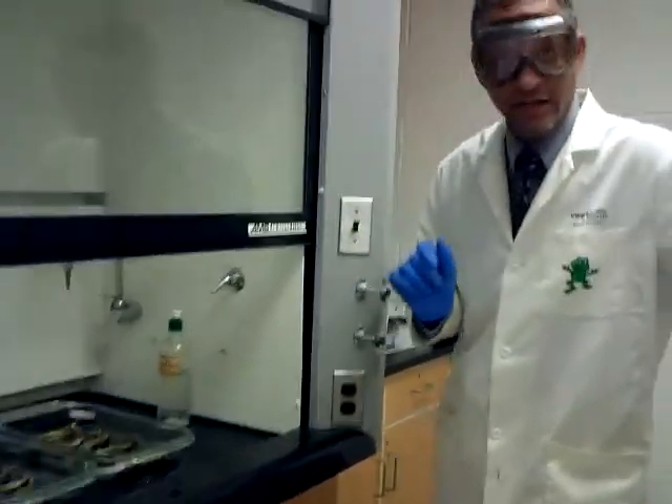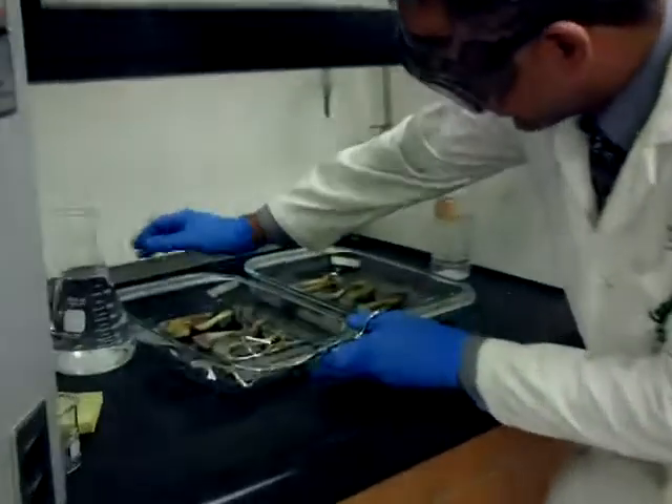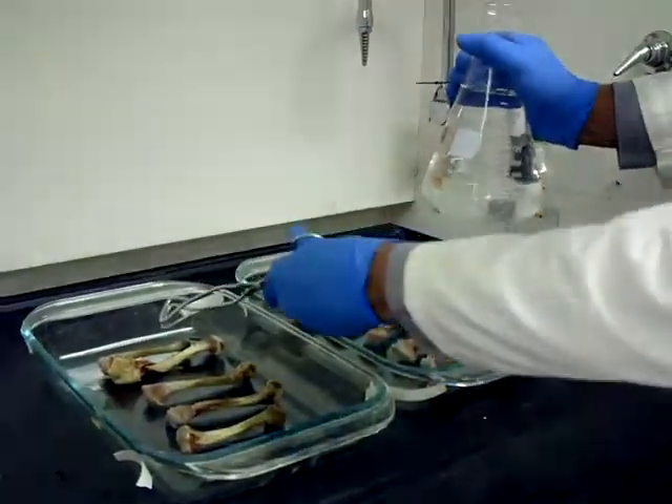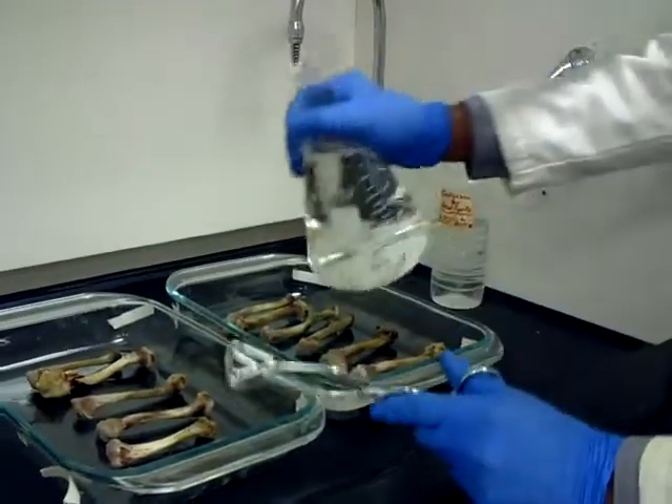Now we're ready to add the nitric acid, and then what we have to do is let this soak overnight. First order of business: I know that this is my number one, that's my number six, this is number seven, that's number thirteen.